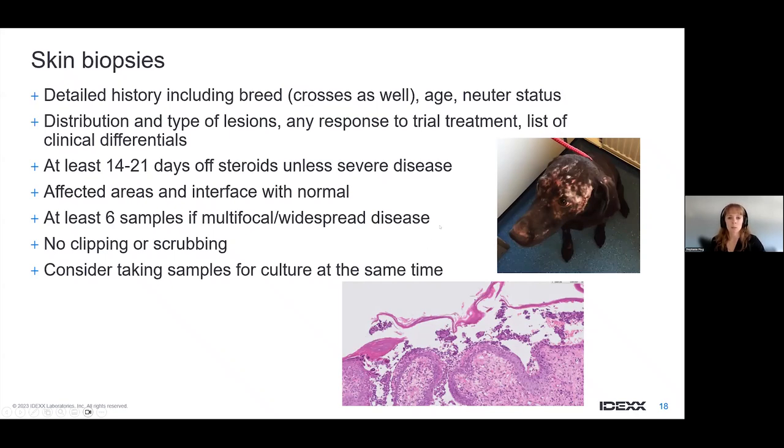And I always say, once you are taking biopsies for histology anyway, unless you're really sure what it is already and you just want a confirmation, it's really helpful to have 1 or 2 samples in saline as well and just save them for culture. You can potentially submit them together with the histology samples and just say on the submission form that you want to put them on hold and wait for the histology report first and then decide if you want to process them. But for me, it really makes sense once you are taking biopsies for histology, just to take biopsies for fungal culture and bacterial culture at the same time, just in case.